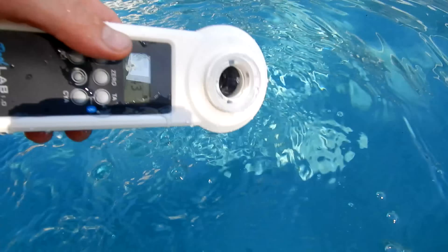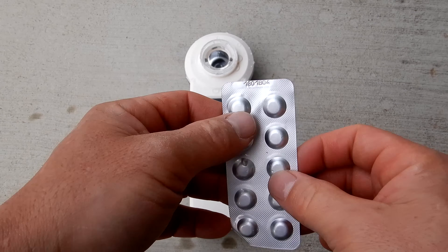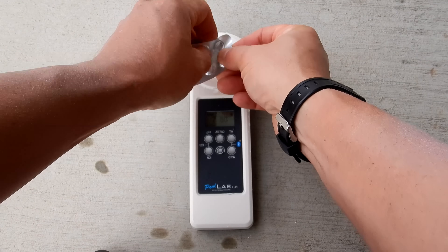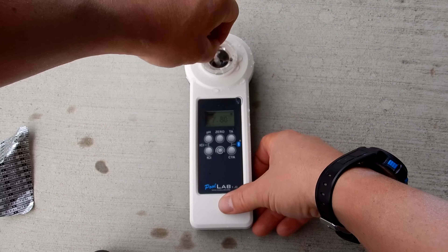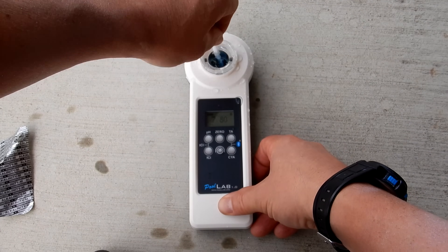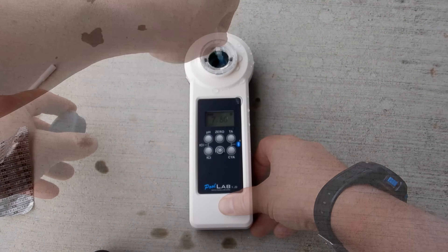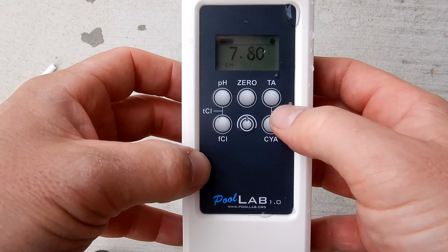I'm going to go ahead and clean it out and get another sample for the alkalinity. I have the alkalinity tablet. If you're running a series of tests, you don't have to zero it out every time — just when you initially start it up. Again, don't touch the tablet. I'm going to break this one up for the alkalinity. All you do is drop the tablet in and break it up. Okay, let me go ahead and cover it.